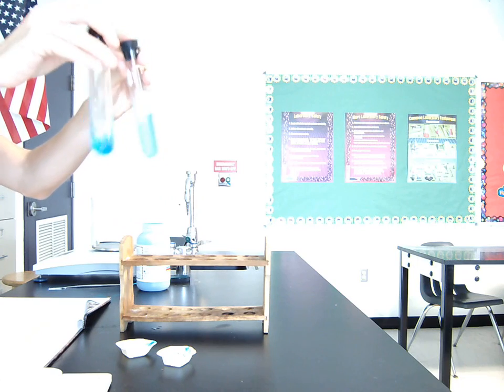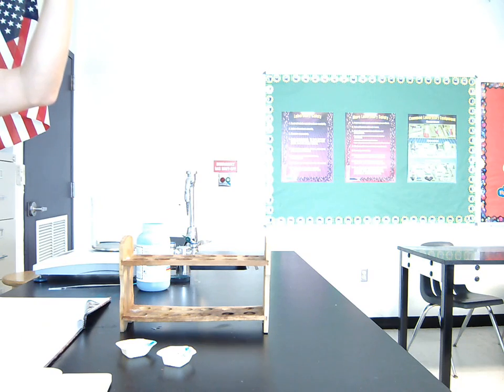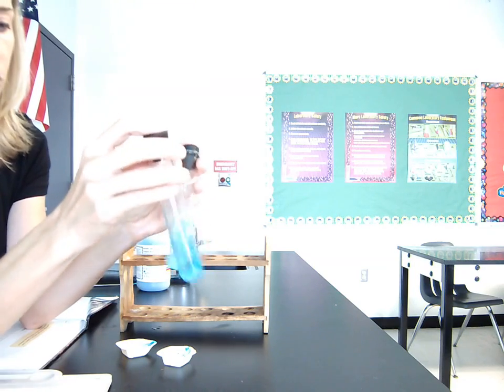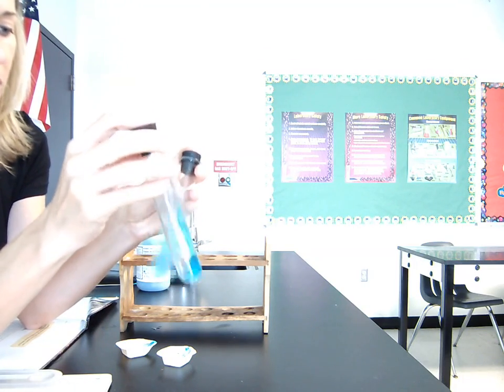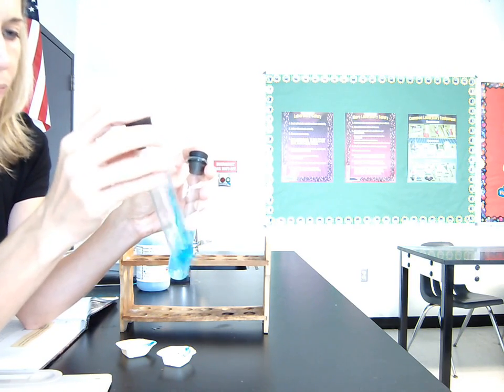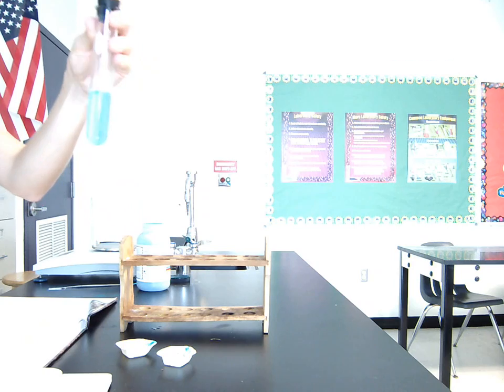Okie dokie. The first blue dot question, if you look in your book, says, "Did all of the solid dissolve in both test tubes?" So the first thing we want to do is make sure we shake it long enough. We want to make sure it's shaken long enough to give it every opportunity to dissolve if it's going to. After a little while, if it doesn't dissolve, then, if we've mixed it long enough, we can feel confident that we gave it its best shot. But if you don't mix it long enough, then you're not really sure if it's because of the mixing or if it's because of the solid. So we want to give it enough chance to dissolve. Let's see. Okay, this looks good.